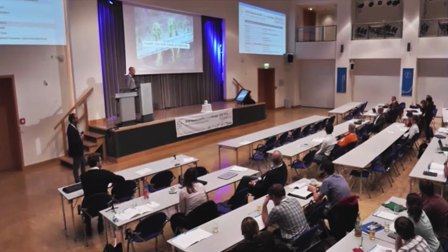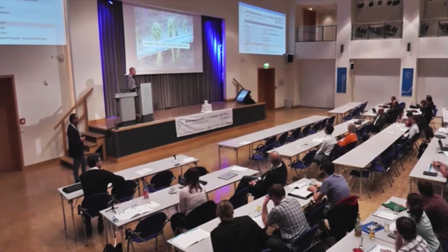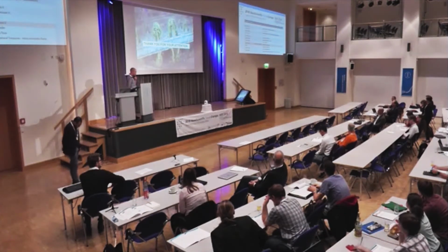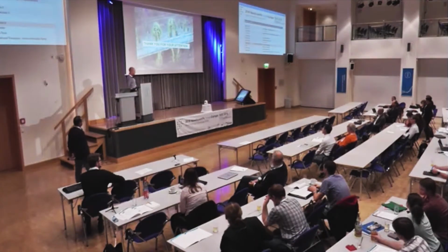Great talk. Again, I'm not a biologist, but what interests me most is the AFM technique and how you employ it on these biological systems. You detailed a bit of what you're doing, but what do you expect from the AFM technique in order to improve these measurements? I mean measurements in liquid, or analyzing more mechanical properties for these case studies. What is your wish list, let's say, for AFM inventions?